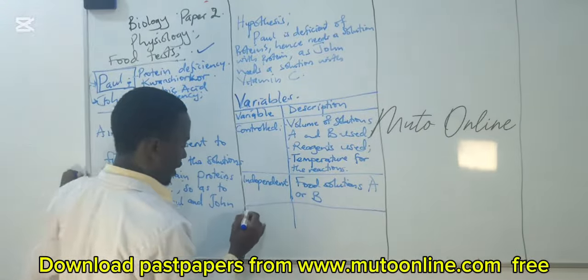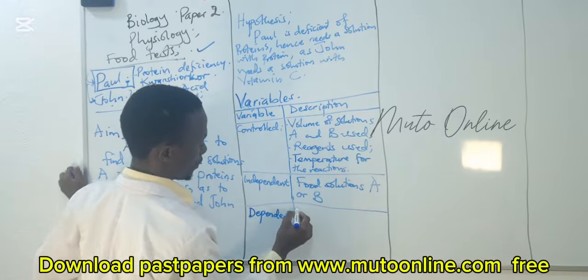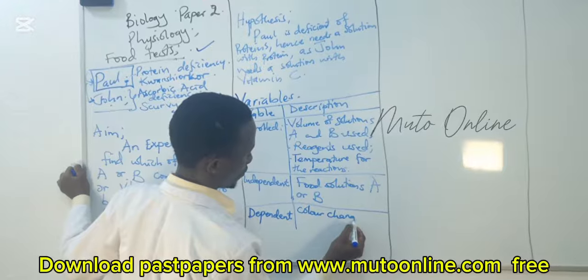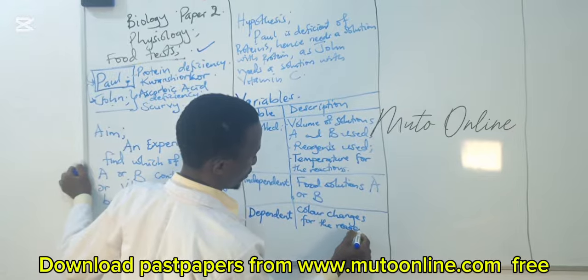And then the dependent, what will I be looking for? It is the color changes for the reagents.